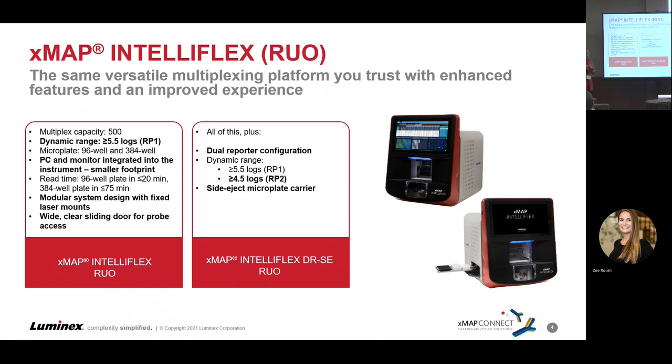It also has a wide sliding access door. This door slides so you have much easier access to the probe for the hands-on maintenance that you're used to doing for Xmap instruments. It's a really well thought out and well designed instrument. We heard input from our legacy instrument users and took each of those pieces and thoughtfully put that into the design of this instrument to make it better.